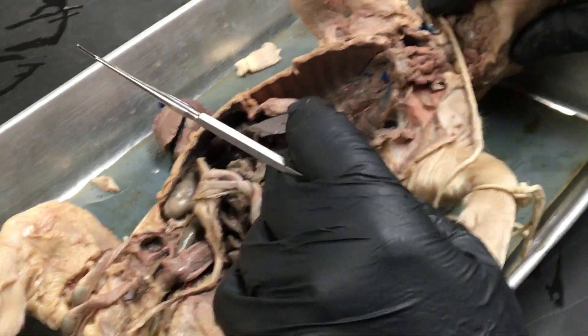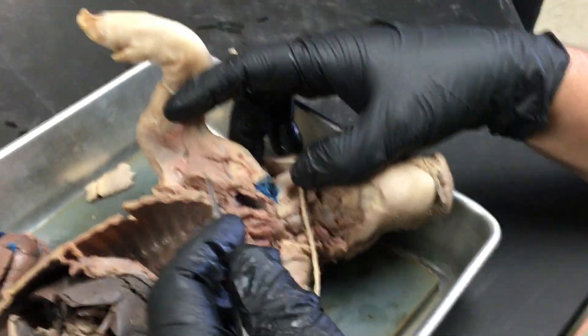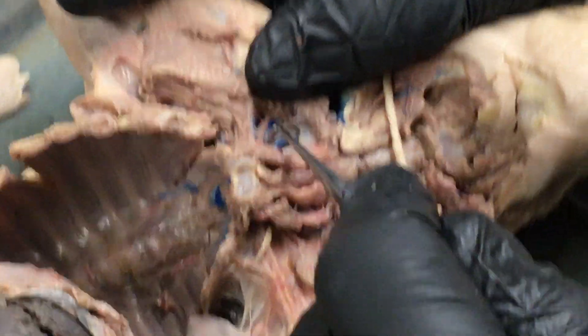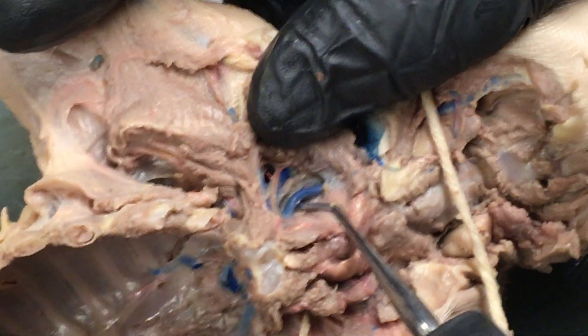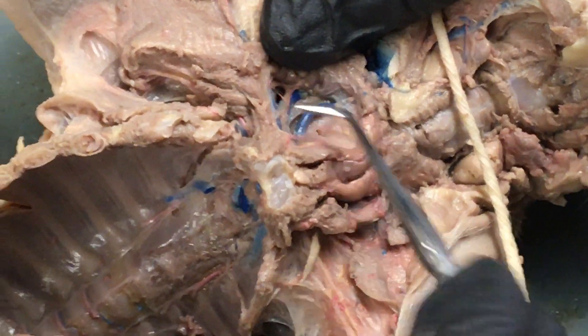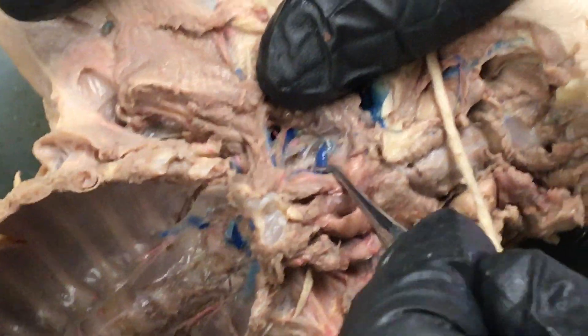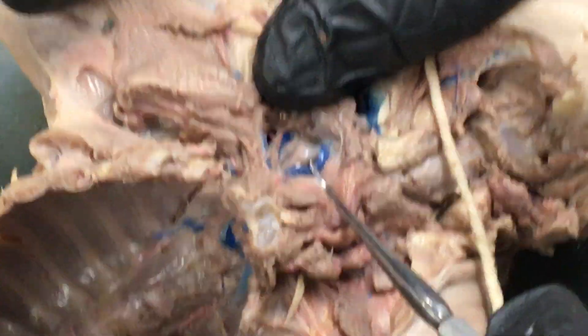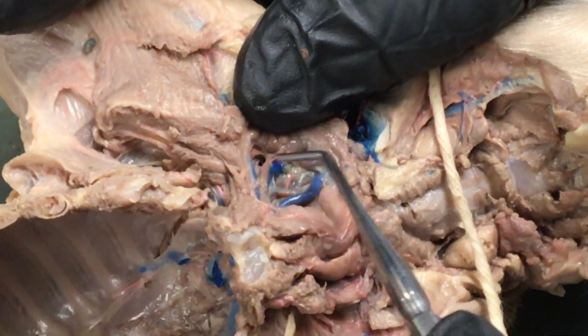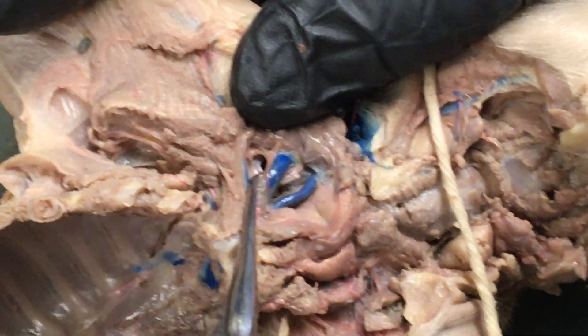Let's go check out the circulatory system. We'll start here on the neck. I did a small window of dissection here so that we could see the internal jugular, which is the blue one. And we can see the carotid artery — it's kind of the tan colored thing that I'm hooking right now, that's the carotid artery. The external jugular is this large blue thing right over here — that's the external jugular.